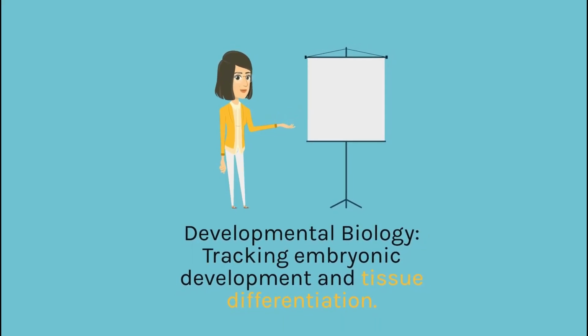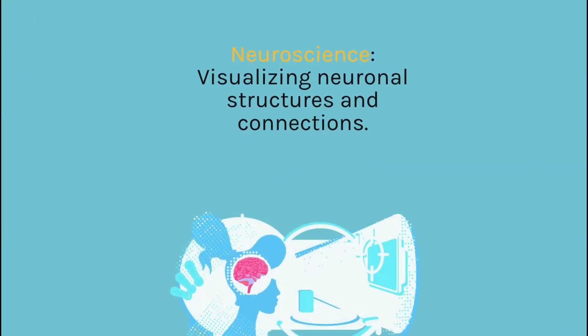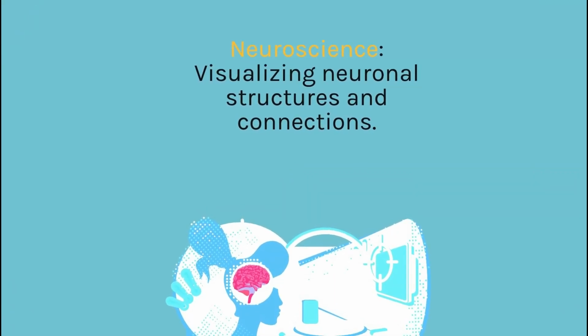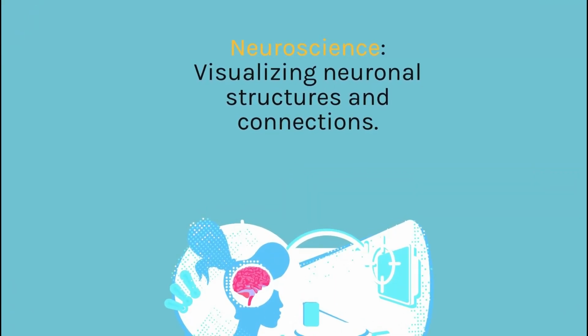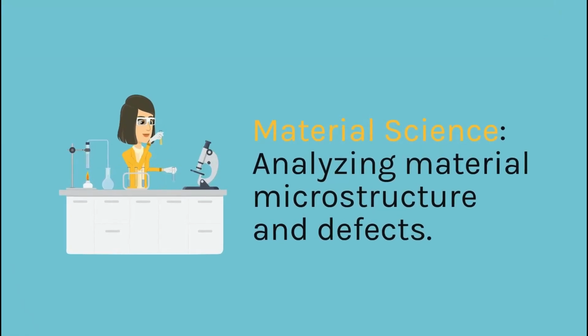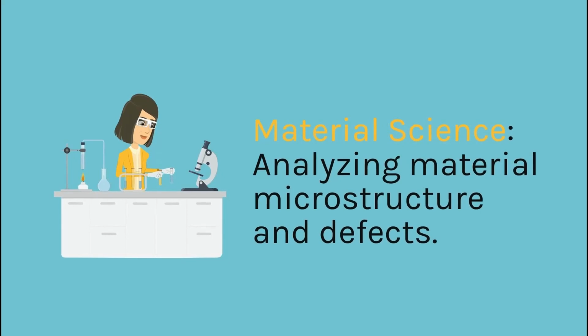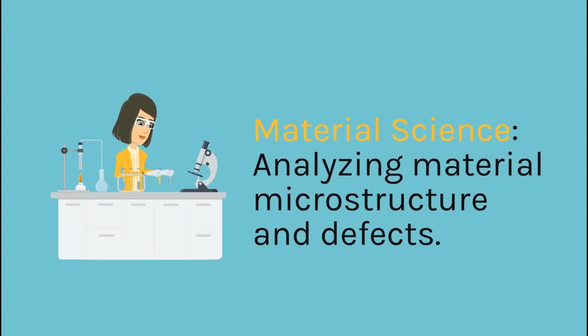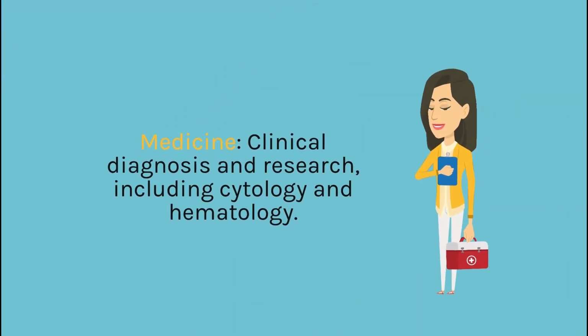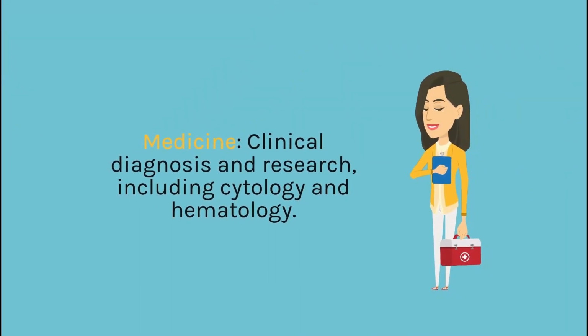Neuroscience, visualizing neuronal structures and connections. Material science, analyzing material microstructure and defects. Medicine, clinical diagnosis and research, including cytology and hematology.